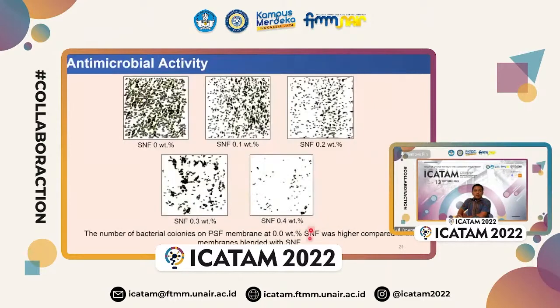And for the antimicrobial activity, we can see here that with the increase of the concentration of the nanosilver particle, there is a decrease in the bacteria colony growth on the membrane surface. So the silver nanoparticle works perfectly well in controlling the growth of the bacteria colony.